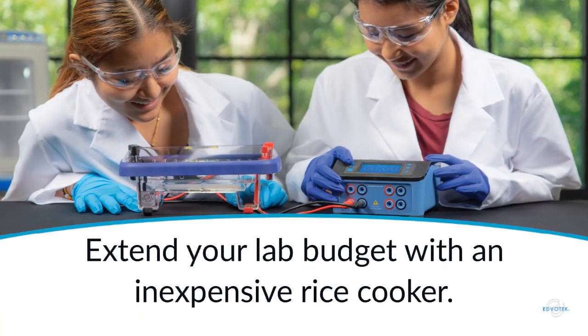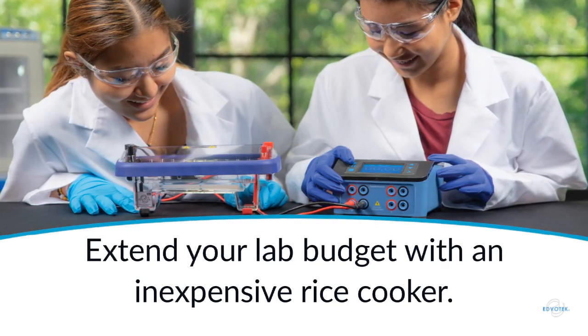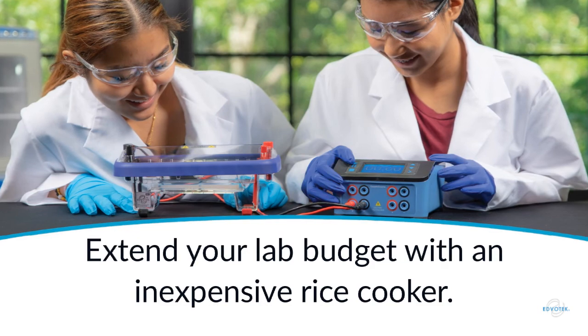Do you want to prepare gels in your classroom but you're on a tight budget? Invest in a personal rice cooker to melt your agarose.